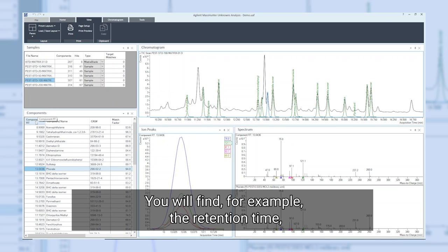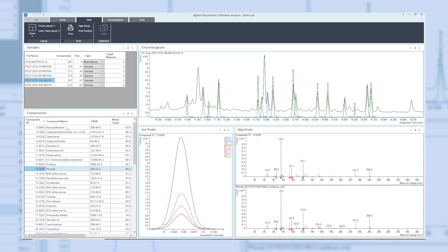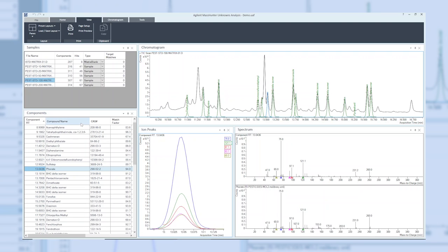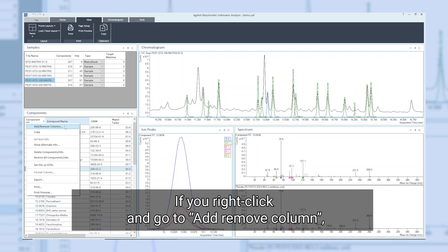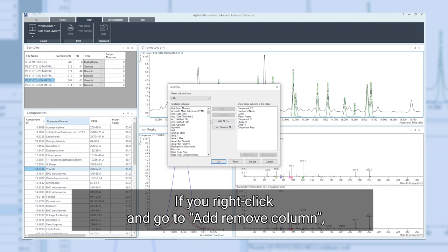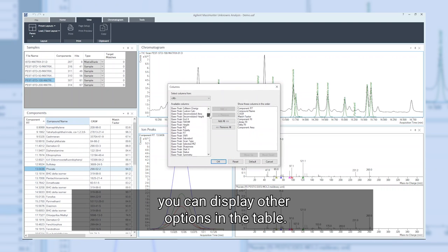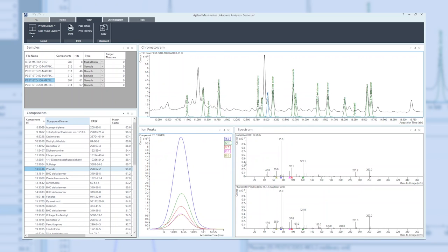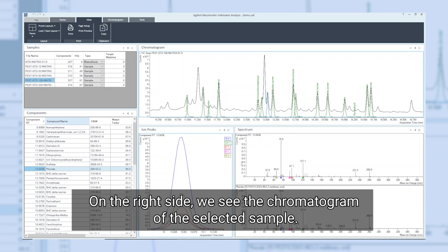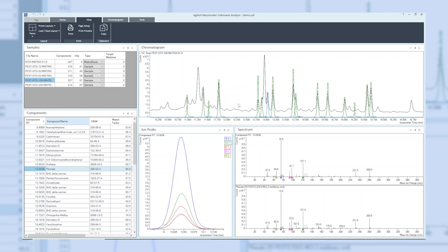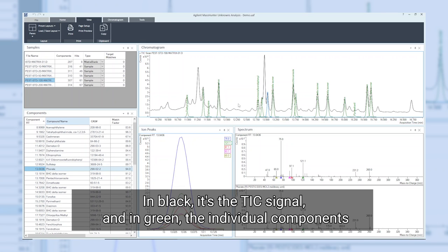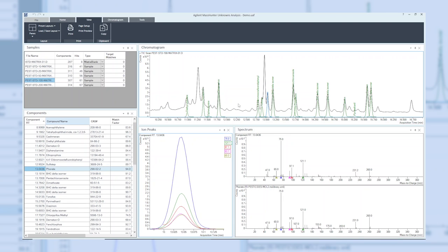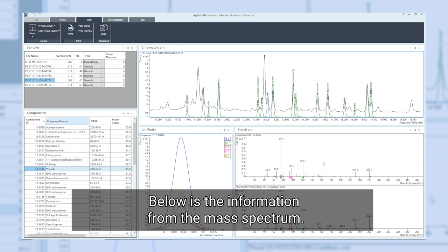The details for each of the samples can now be found in the components table below. You will find, for example, the retention time, compound name, match factor, and many more categories. If you right-click and go to add/remove column, you can display other options in the table. On the right side, we see the chromatogram of the selected sample. In black, it's the TIC signal, and in green the individual components that have been identified in this chromatogram. Below is the information from the mass spectrum.